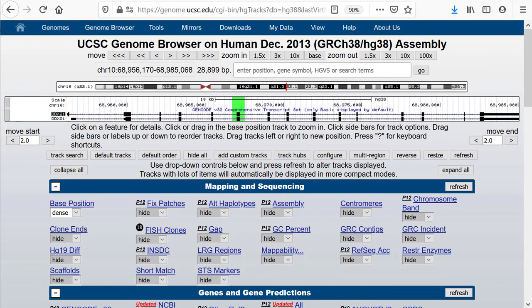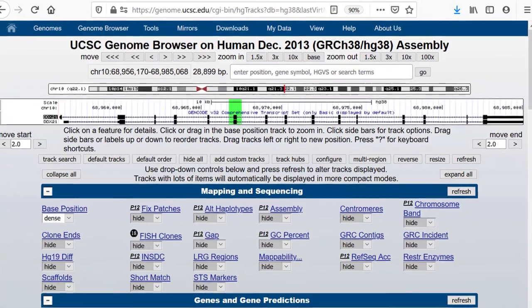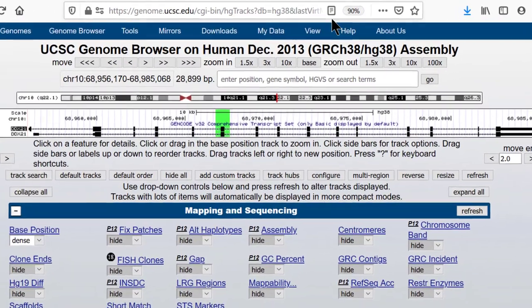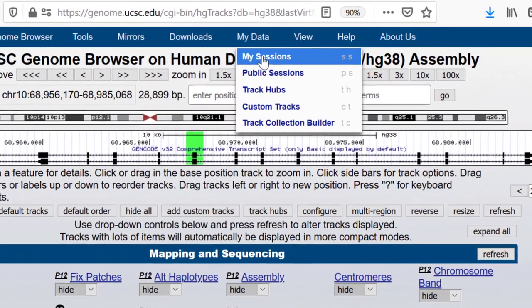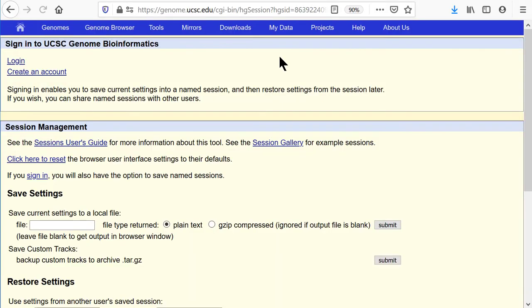It is worth mentioning that the cart can also be exported via the saved sessions page. Go to My Data, My Sessions, and in the save settings section, choose the option to save to a file.